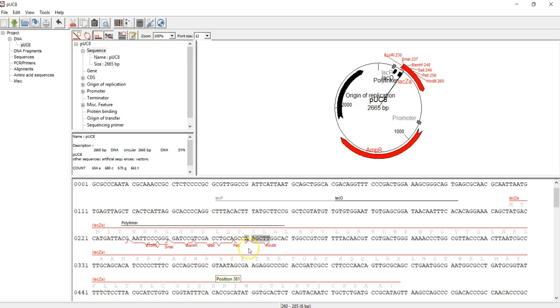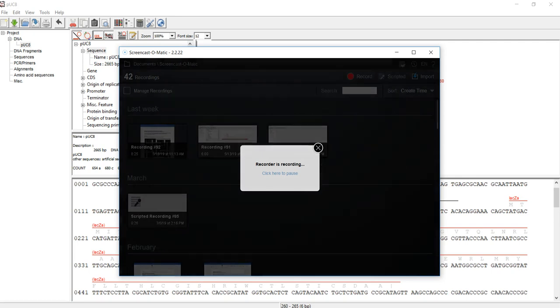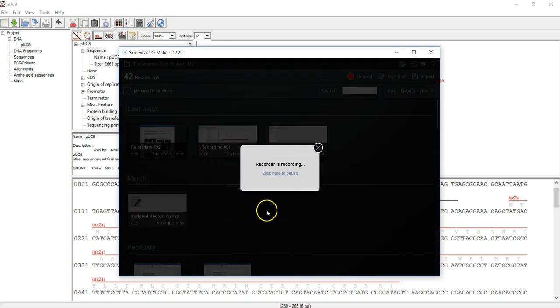This pointy arrow means the cutting site is here, which means the enzyme will cut one cut here and the second cutting site on the complementary strand at this position. That's all for today's demonstration.